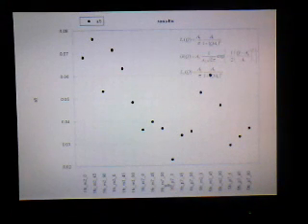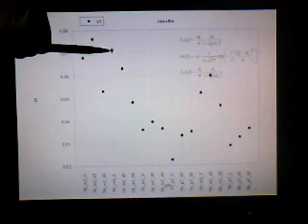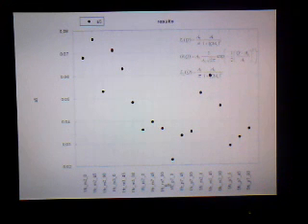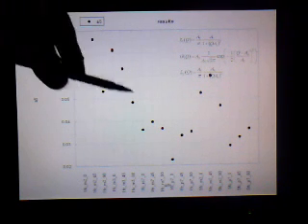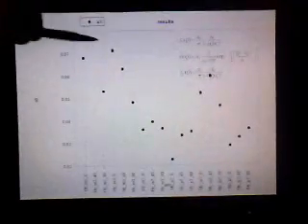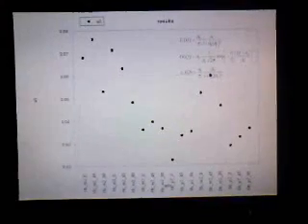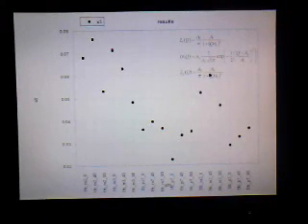Again, it's a systematic behavior. The error bars are very small here in this case. You can hardly even see them. These error bars represent how large you can perturb that parameter and increase the value of chi-squared by the value of 4, which is a 2-sigma error bar. And the fact that these are very small error bars means that the data are very sensitive to this quantity in the bulge, the amplitude.